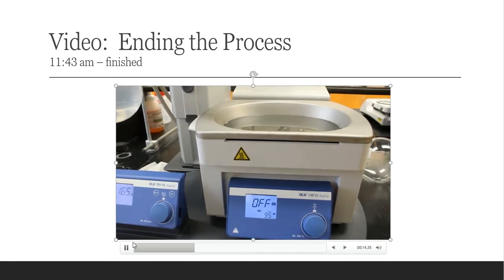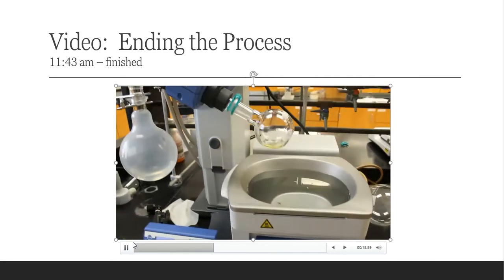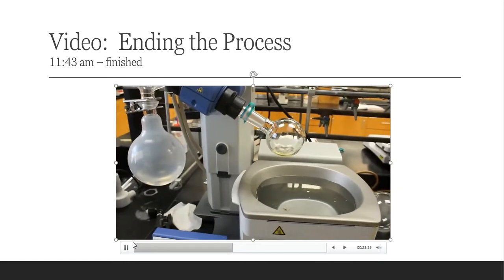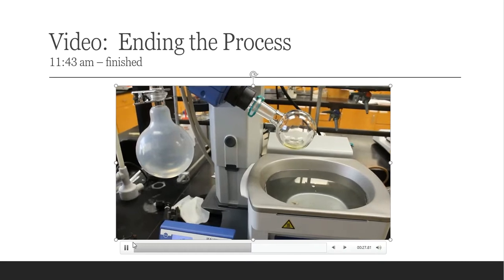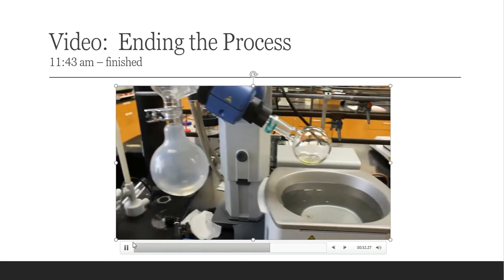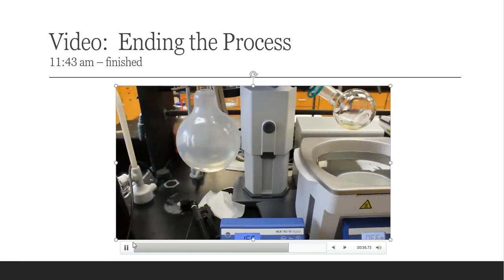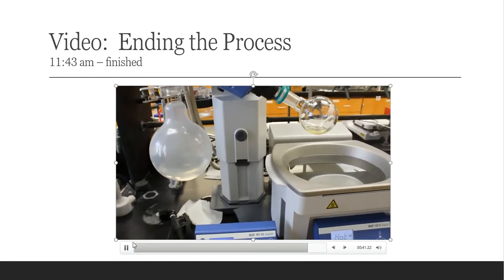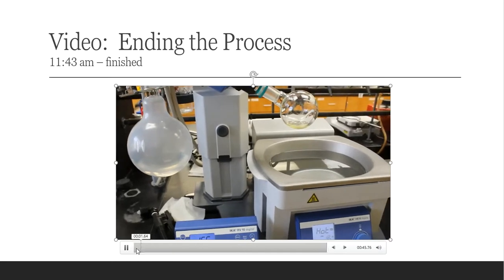All right, so I've raised the elevator. And in raising the elevator, you're seeing that I'm allowing the beaker or the boiling flask, the Florence flask in this case, to spin. I'm doing this just to get any residual solvent that might be left behind off. And over here to the left-hand side, you see my receiving flask is pretty full of liquid. All of that is petroleum ether that maybe I can reuse in the future, as long as I check it to make sure that it's pretty good.